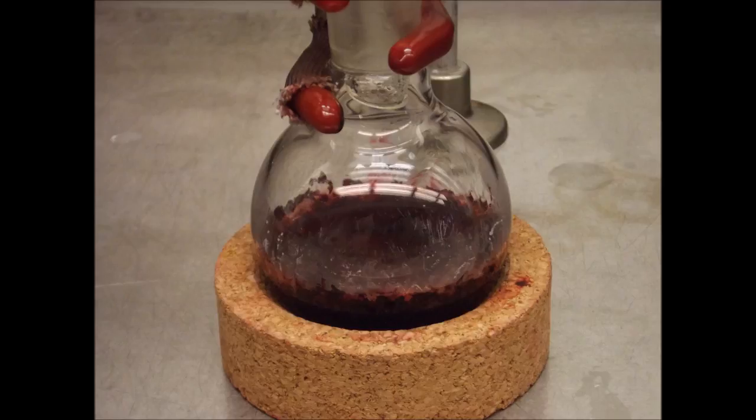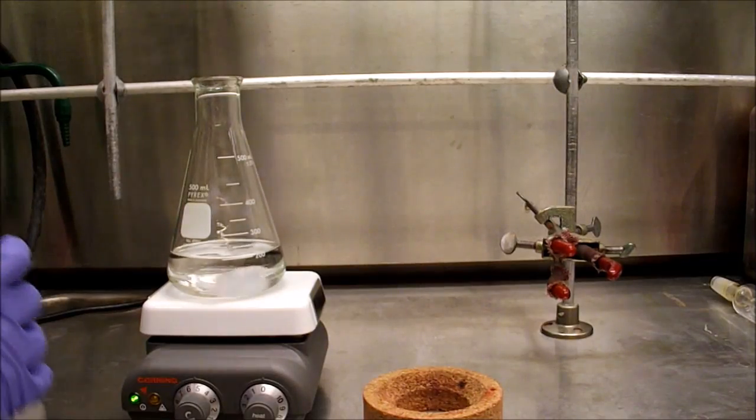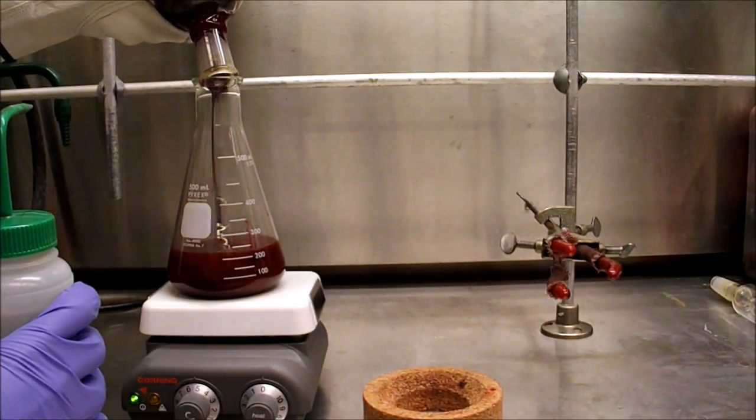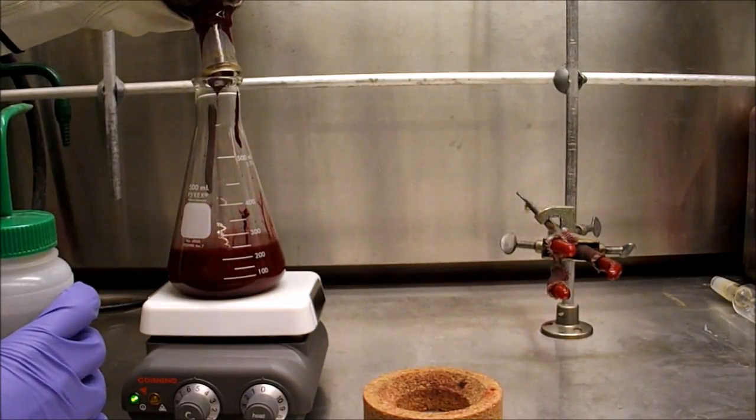To a 500ml Erlenmeyer flask is added about 200ml of methanol and it is stirred rapidly. At this point, the reaction mixture is immediately added to the methanol.